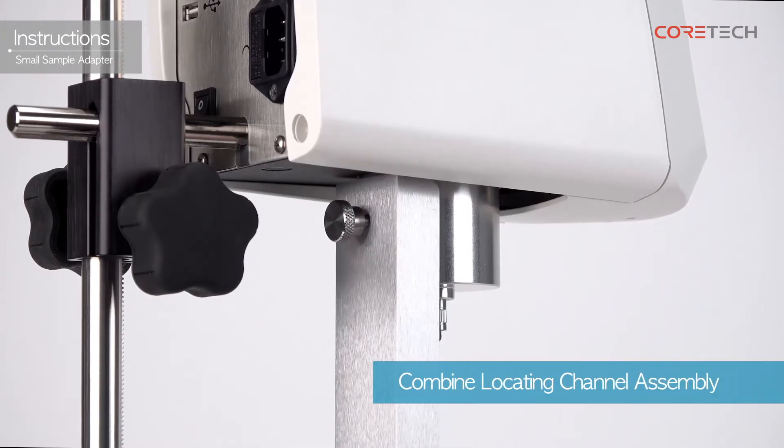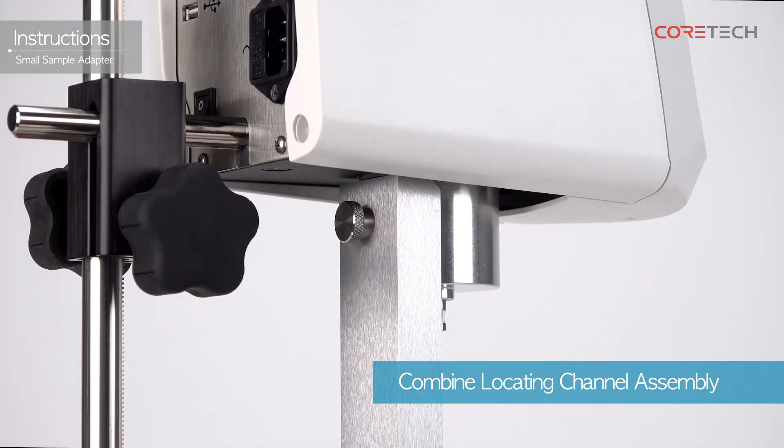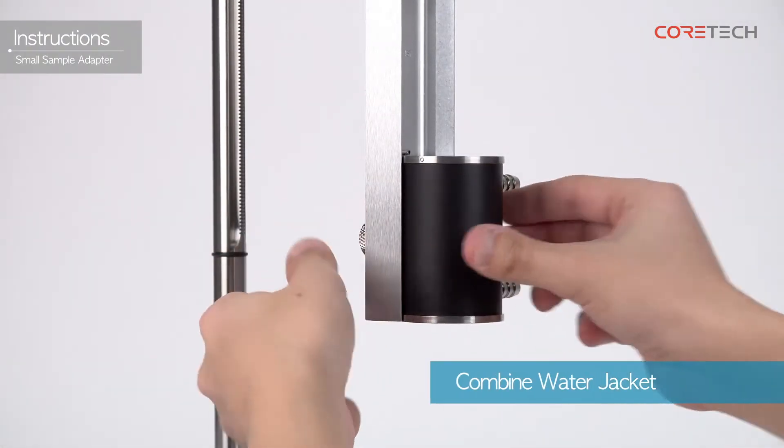Rotate the screw at the top of the locating channel assembly clockwise to combine. Then attach the water jacket to the bottom of the locating channel assembly.